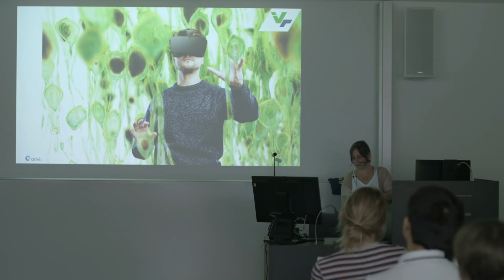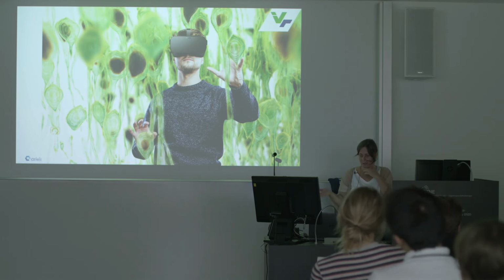And this guy here, this is a model, is wearing the Oculus Rift goggles, because those were the first really technically advanced at that time. And that is a data set, also a brain data set with a nice color mapping, and everyone is of course invited to come to us during the next days and have this goggles experience themselves.